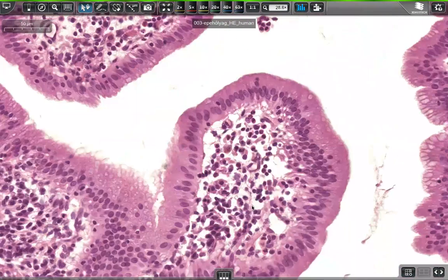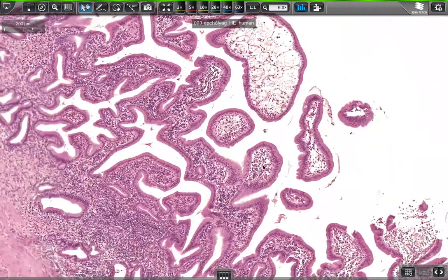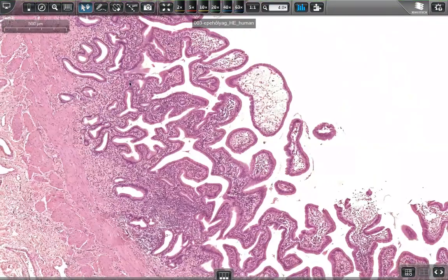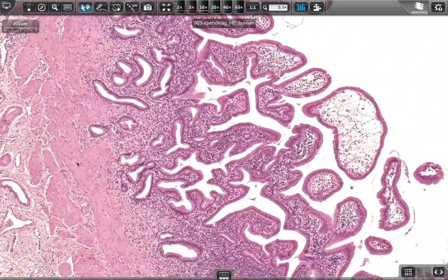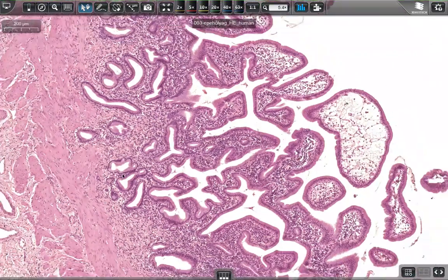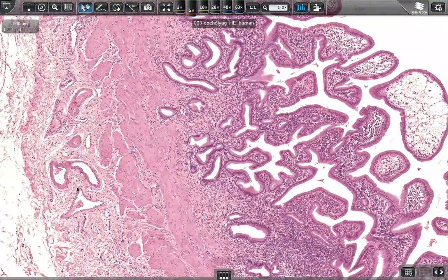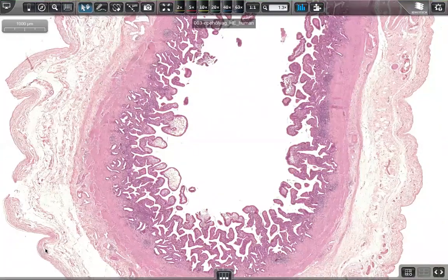Then that's the lamina propria, which is a cell-rich connective tissue, and underneath the lamina propria, the muscularis externa begins immediately, having the smooth muscle fibers there, and under it there is a connective tissue. It depends on the exact location of the gallbladder.